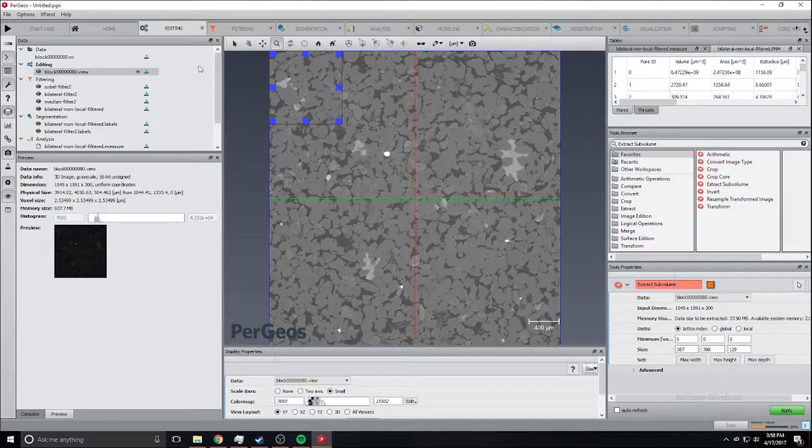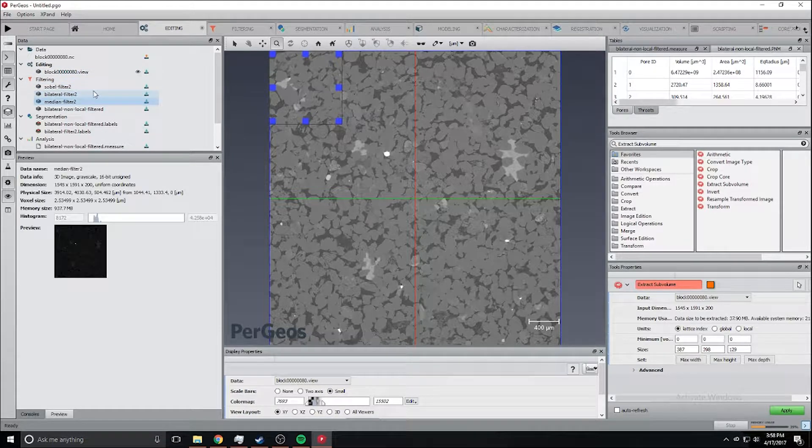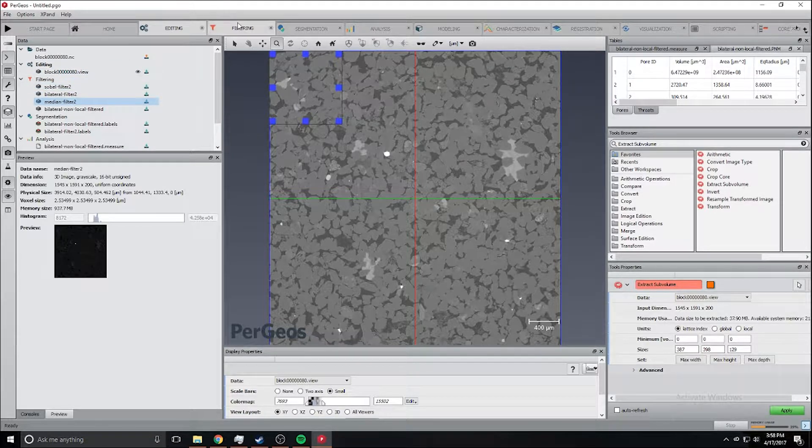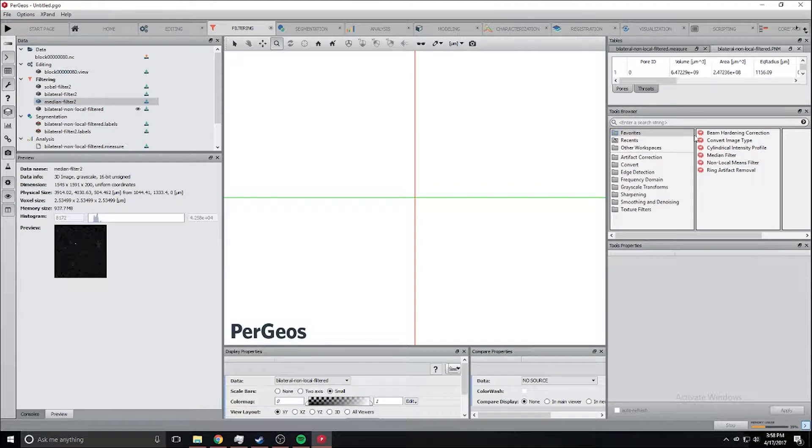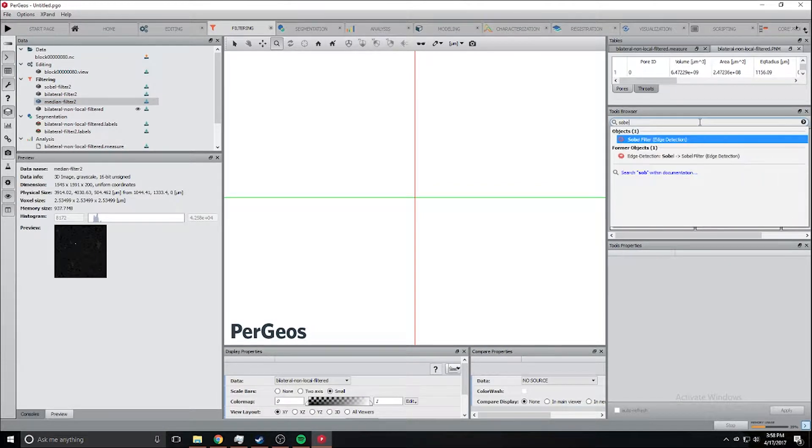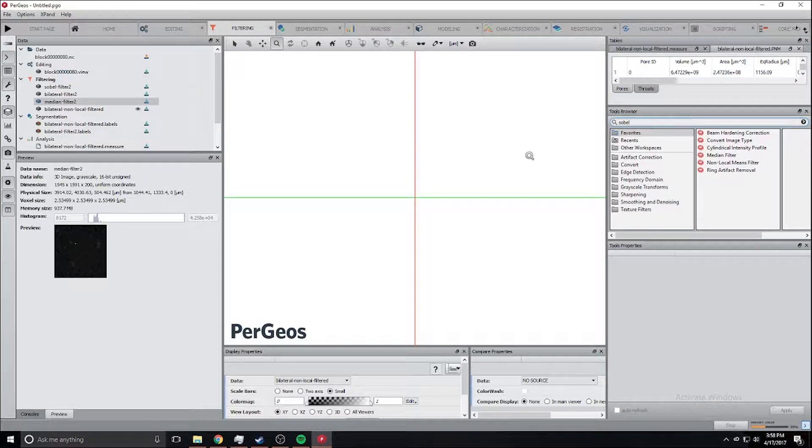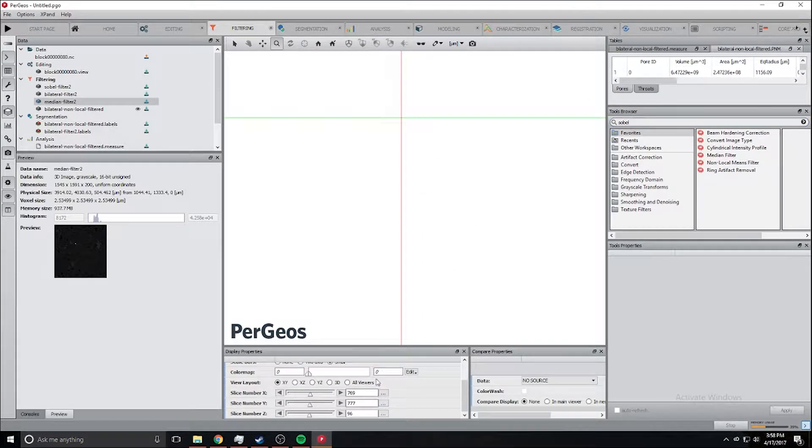We want to apply the Sobel filter, bilateral filter, and a median filter. You can do this all by just searching those filters in the filter workspace. Let's go over what each of these filters does.